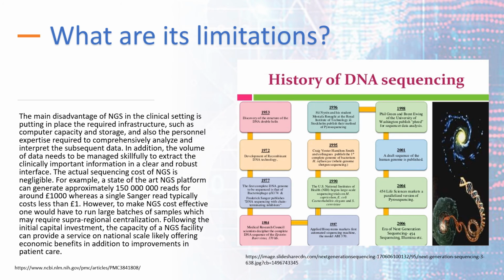Well, even though this technology is great, it does still come with some limitations. The main disadvantage in clinical setting is putting in place the required infrastructure, such as computer capacity and storage, and also the personnel expertise required to comprehensively analyze and interpret the subsequent data. In addition, the volume of data needs to be managed skillfully to extract the clinically important information in a clear and robust interface.